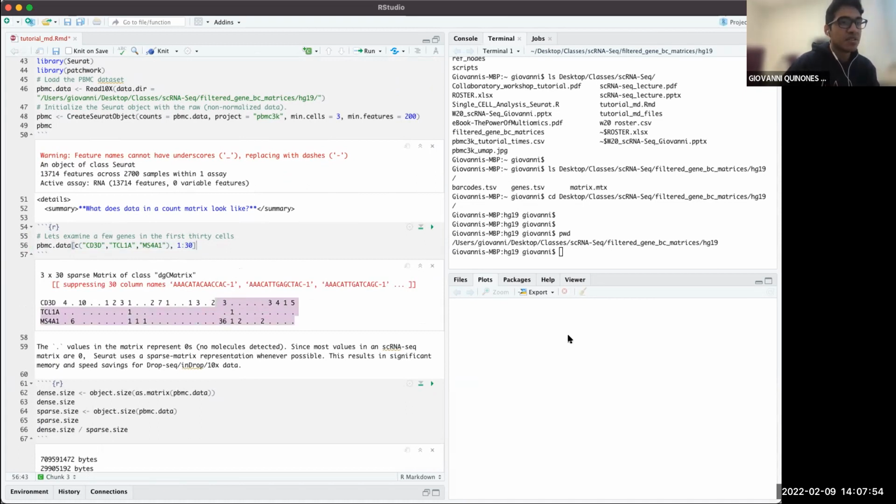I believe there was a question. Okay. There is no question, so please run the second cell.